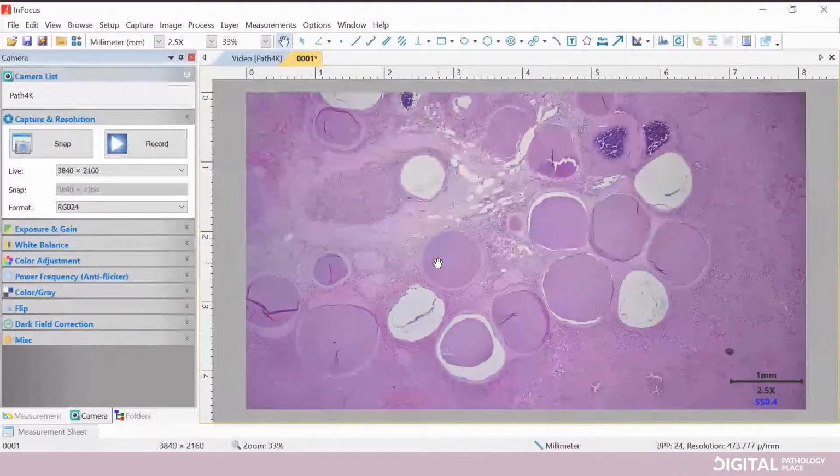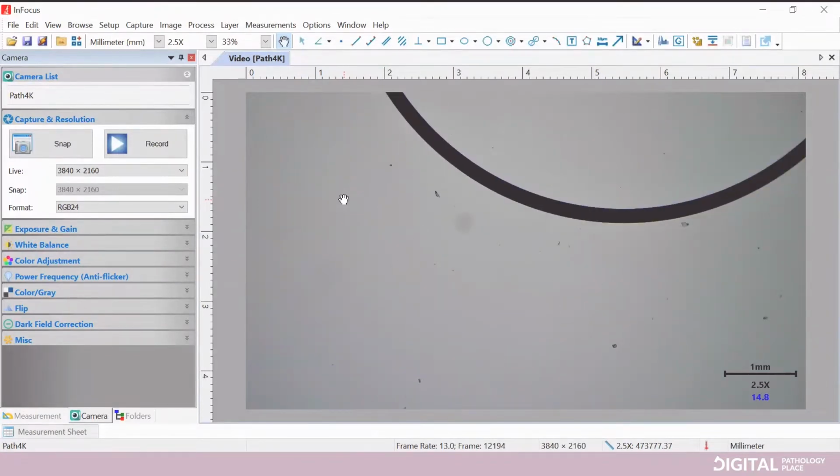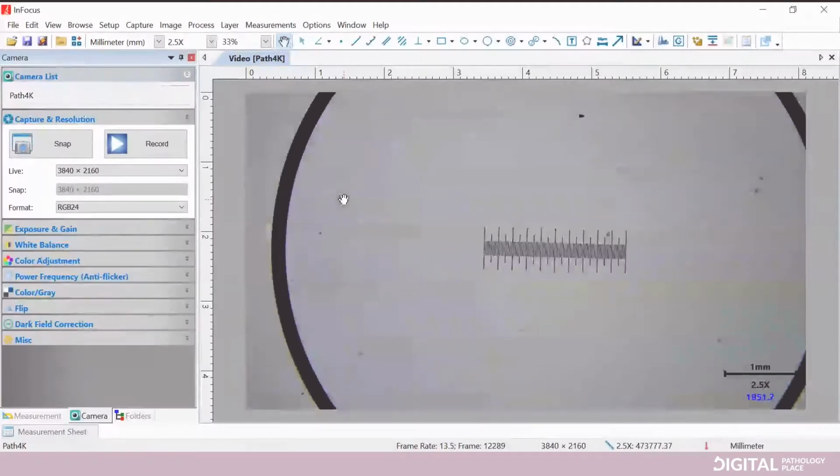Oh, and sorry, we're on our captured image, so let's close this so we don't get confused again. But here we're back to live. Where is my thing? And yeah, the only challenge, there you go, is finding this out. You had it. There you go. Let me find it. Perfect. Now we have it.